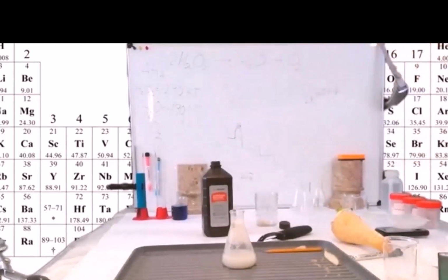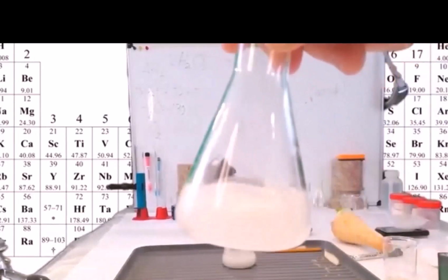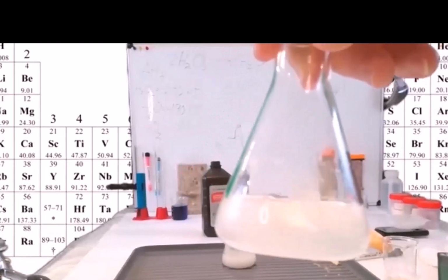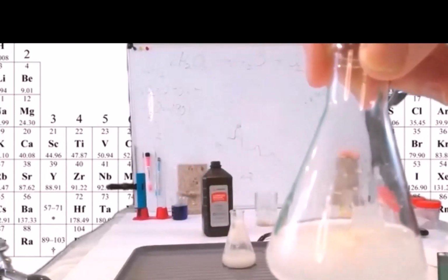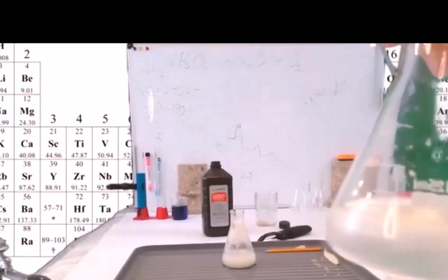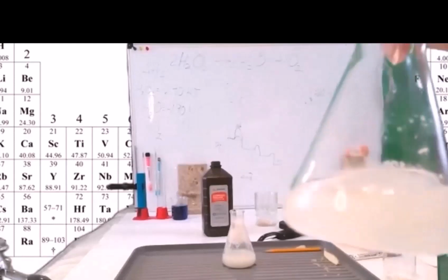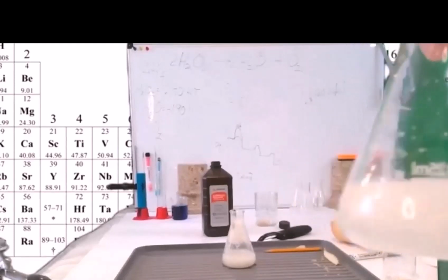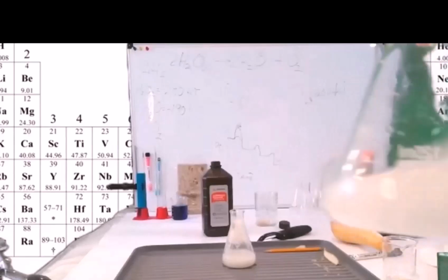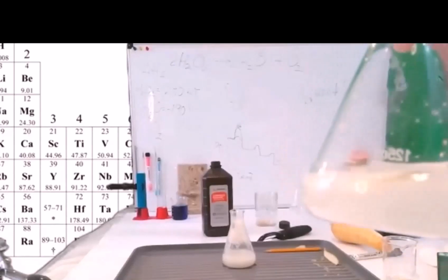What effect was this in terms of reaction rate? Why am I getting more bubbling now than tossing those peels in? Because you're increasing the surface area and you increase the concentration. Oh, yeah. I'm not sure about concentration. I would say surface area. That is good. Concentration, because we have a solid, I don't think so. Oh, okay. Maybe there's also some juice in there.